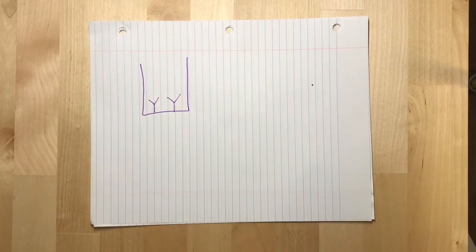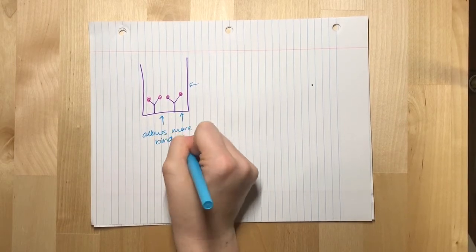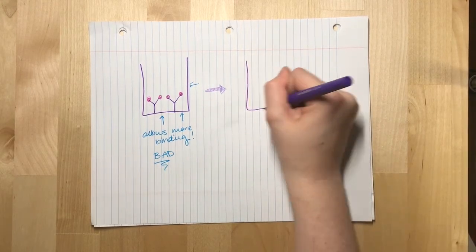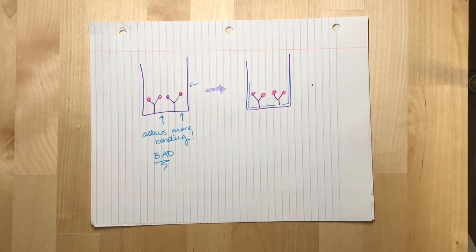Another problem to solve is that you want to prevent residual molecules from binding to empty spaces on the well that aren't bound by your antibody or antigen. A blocking agent is often added, which prevents background interference by binding non-reactive proteins to available space on the well.